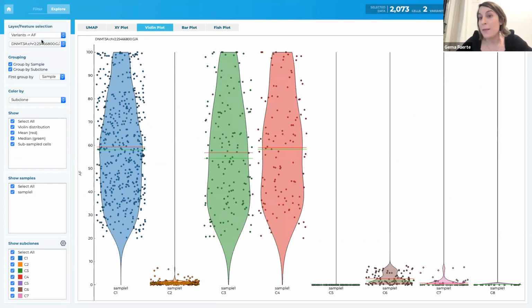So this violin plot will allow you to study further these individual clones and see whether they are real or they are artifactual clones. For the sake of this demo, I'm not going to give you additional information on this window, just so you know this is available. And perhaps we can have a different session or a follow-up session to go more in depth for these filters.